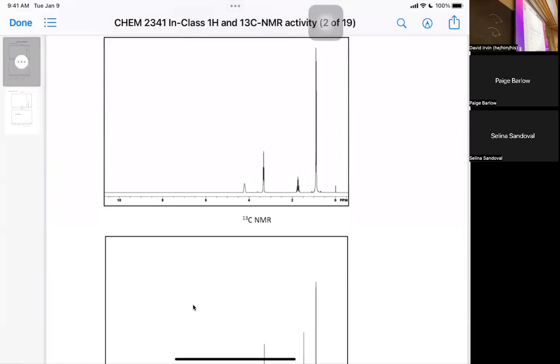That little teeny peak there is actually 3 peaks together, and it's for chloroform. It does a weird thing. So the little tiny peak in a carbon NMR, which looks really wide, that's the solvent. So you want anything taller than 1 inch, or else it's probably not a signal.